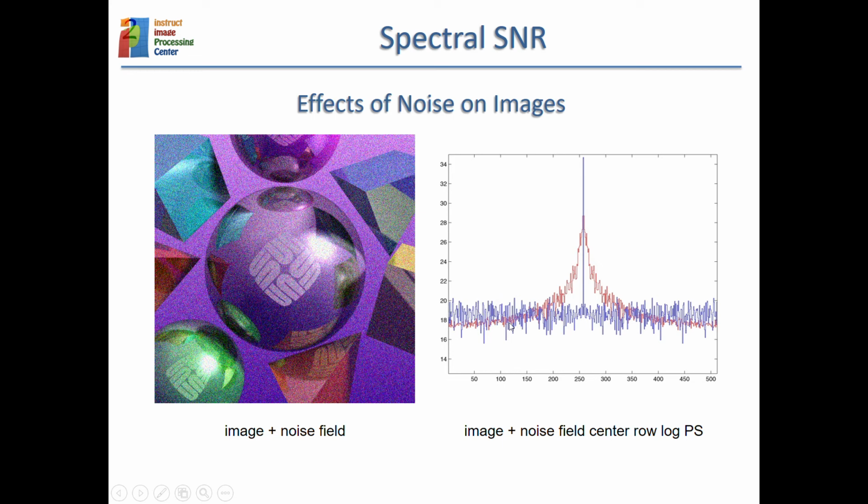And that is why we require many particles to have high resolution 3D reconstructions, because the more you average, the red component that is coming from the signal stays the same, but the blue components that are coming from the noise get lower and lower at all frequencies. This is the same effect, but now in frequency domain, as the one we saw with Lina and averaging 1000 images of Lina.